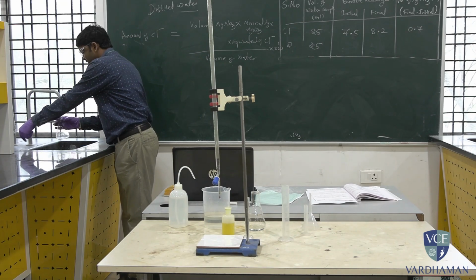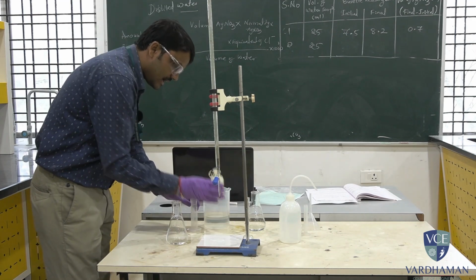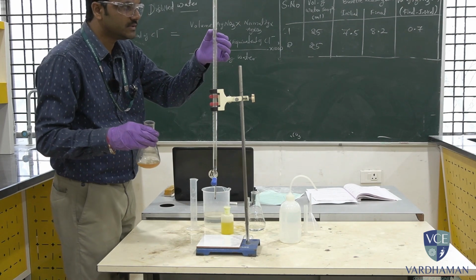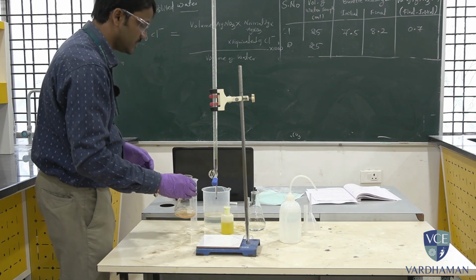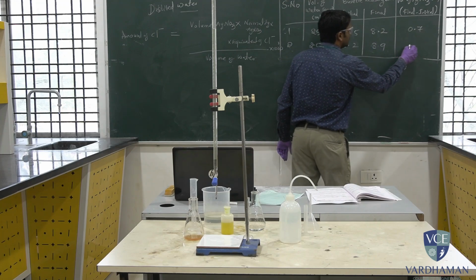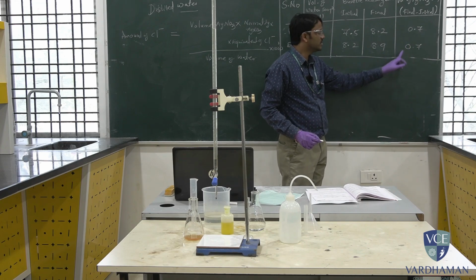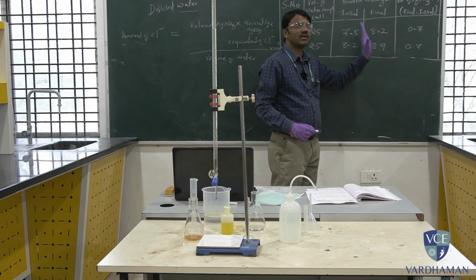We have to remember this point always. Take 25 ml of distilled water, add a few drops of indicator, and titrate against the silver nitrate solution. We got the red precipitate, which means we reached the end point of the reaction. Now it went from 8.2 to 8.9, so this is also 0.7. If you get this kind of value, it means we got concordant values; both are the same. If you get it, there is no need to perform further experiments. If you don't get it, you have to perform again until you get the concordant values.